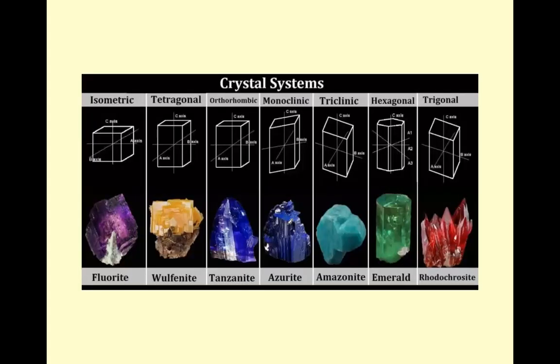Some natural examples you can see here, right? So this is a euhedral crystal, more or less having the perfect crystal shape, and this also. Maybe this one also you can call that, but other ones are subhedral. They are not showing the perfect shape, but maybe this one is showing fluorite, while the other ones might not be showing the proper shape perfectly. Anyway, this is the crystal system that you can observe in nature.